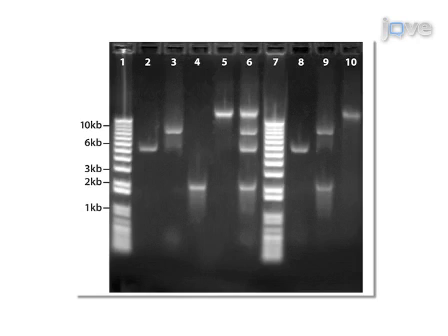Agarose gel electrophoresis confirms that the nucleic acid species can be separated with less than 9% carryover. Thus, this method enables the evaluation of the diversity and functional capacity of viral communities.